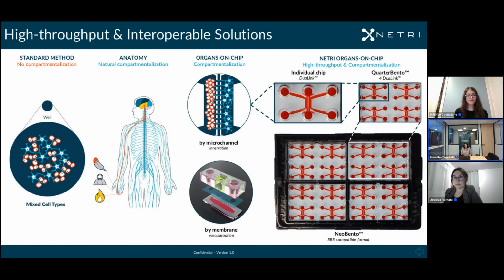And this middle channel mainly has the function of creating a microfluidic barrier. And so in those systems, you can actually culture, for example, on the scheme in the middle, one cell type, for example, pulmonary cells. You can seed them and culture them in the first channel. And then you can culture, for example, sensory neurons on the third channel.